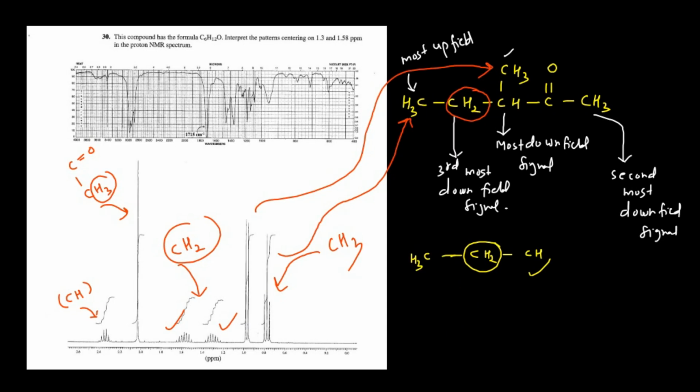Okay, so I am telling you what is happening here. Actually, this particular CH2 will produce a DQ, and the full form of DQ is doublet of quartet. Why doublet of quartet? I'm telling you, the value of the coupling constant. Say for example, I can mark this.